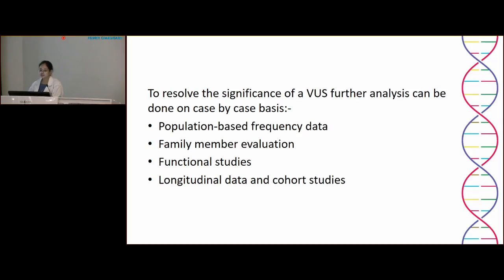For example, when a disease manifests in childhood and some variants are reported in the healthy individual database, we can go back and check, because if the variant is there, it means it is not the causative variant, because it would have presented and the data from that individual would not have been incorporated in that particular database.